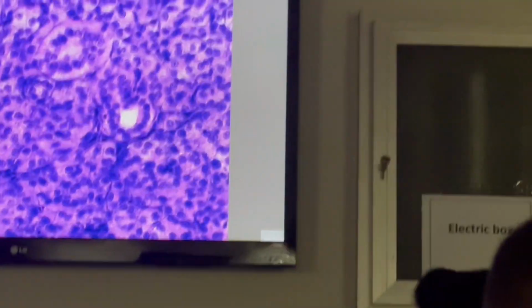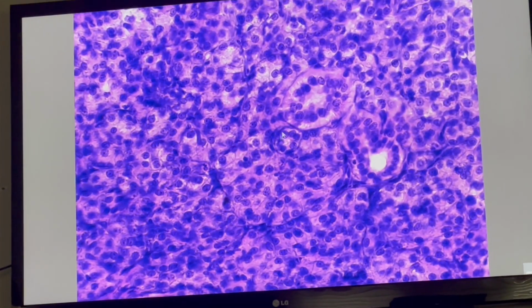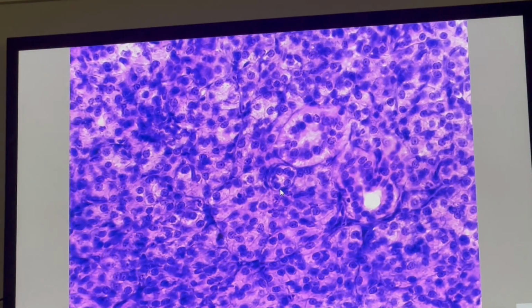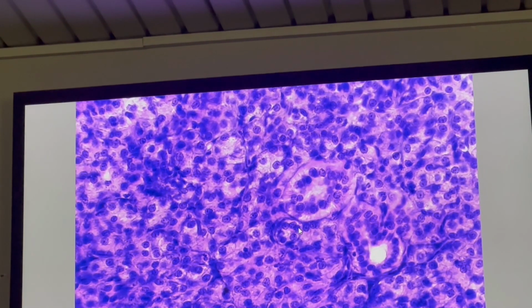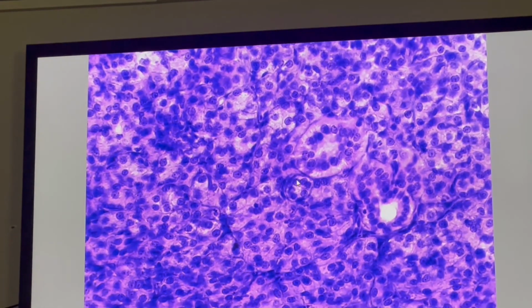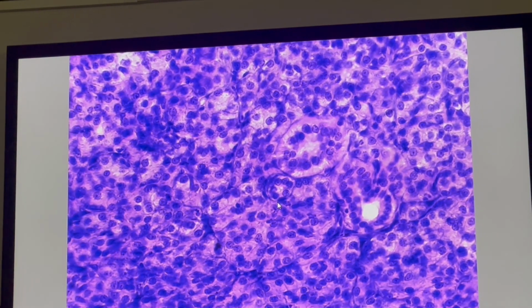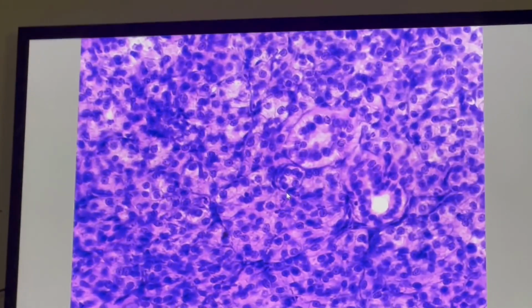Serous acini empty into a short, small intercalated duct. At the tip of the pointer, we can see the intercalated duct. This duct is lined with simple cuboidal epithelium. This is intercalated duct, lined with simple cuboidal epithelium.